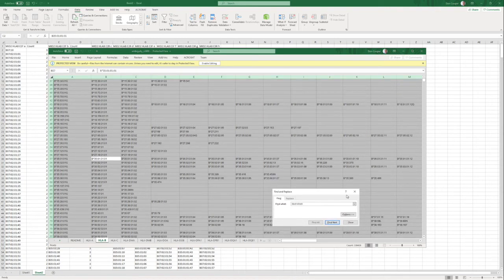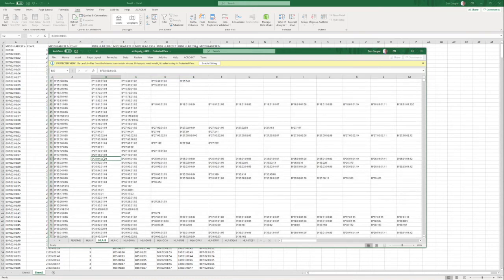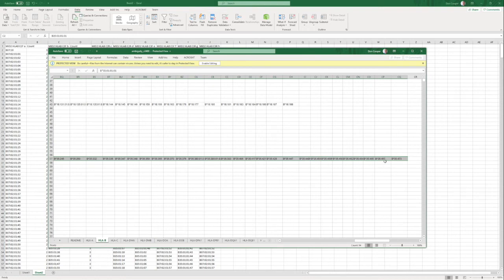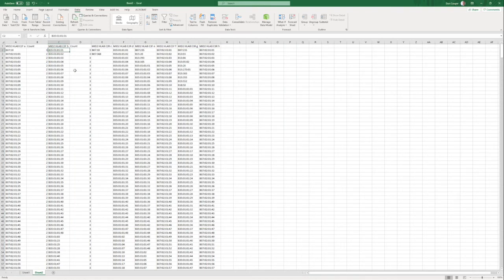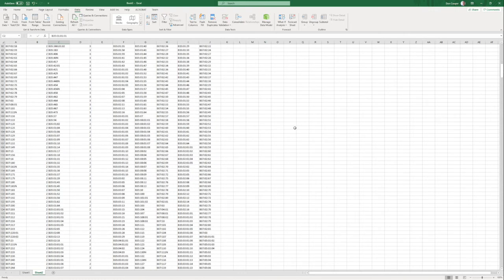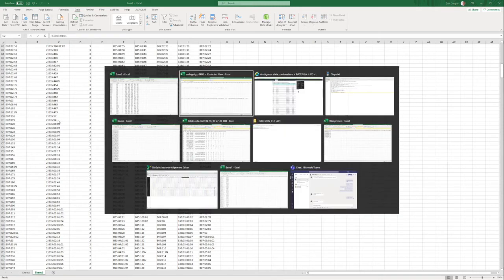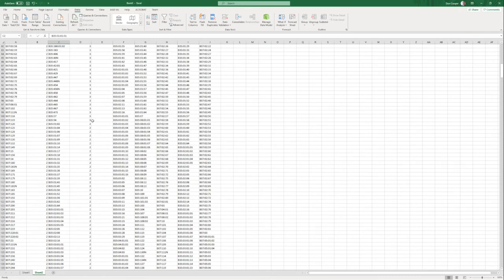There. So we see we have a group which is called B 35, 0, 1, 0, 1, G. And that contains all of these alleles. So hopefully you would see that if you look through this list here, you would see all the same alleles. The sorting won't be quite the same because we've done Excel sorting, which basically sorts things in alphabetical order rather than numerical sorting. So you see that B 35, 94 occurs at the end of our list, whereas their list ends in B 35, 473. So here's B 35, 473 on our list here.